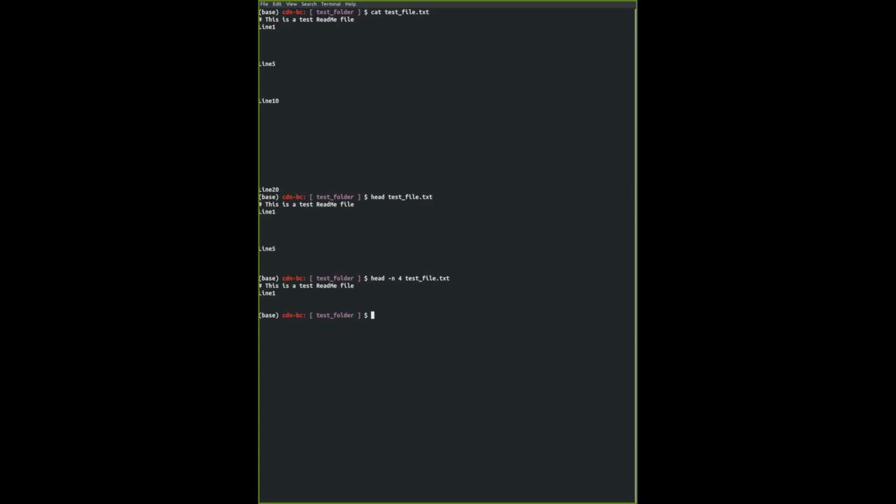This is useful because you might have a document with thousands of lines, and you don't want to clutter your terminal with thousands of lines. You can do so. It will not run into memory problems because this whole terminal thing uses very minimal memory, and it deals with very simple files. So you can print it out, but it can take quite a while if you have a lot of stuff in there.